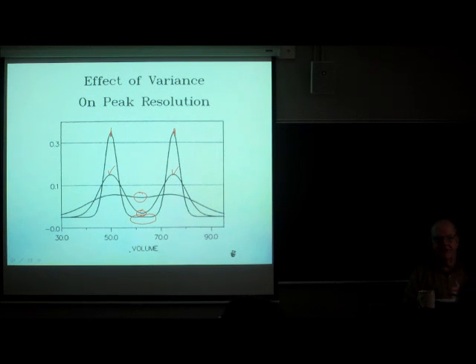It's the difference in the retention volumes or retention times or retention distances in TLC, which we still measure with rulers. Although there are automatic TLC scanners now. Okay, so how we define resolution had better reflect the difference in retention relative to the peak width.